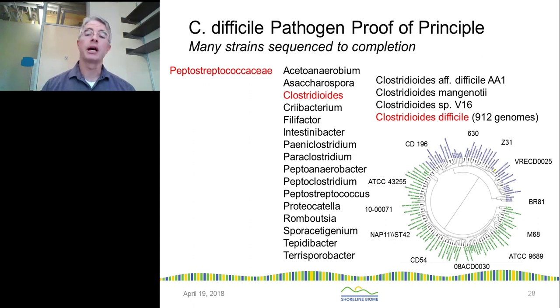And around the outside of that taxonomic tree, that circle down there, you can see I've put in black where the fully sequenced genomes are on the taxonomic tree. And so it gives us a lot of known diversity that's really heavily sequenced, so we can tell whether we are getting the right answer or the wrong answer, because there's a lot of data here.